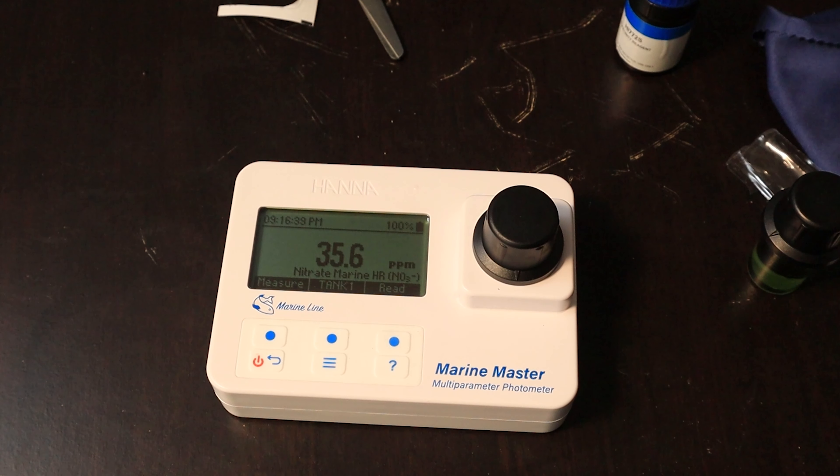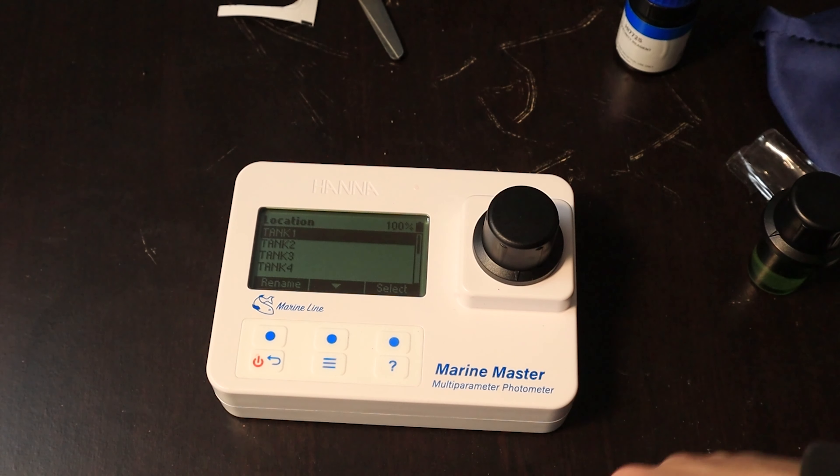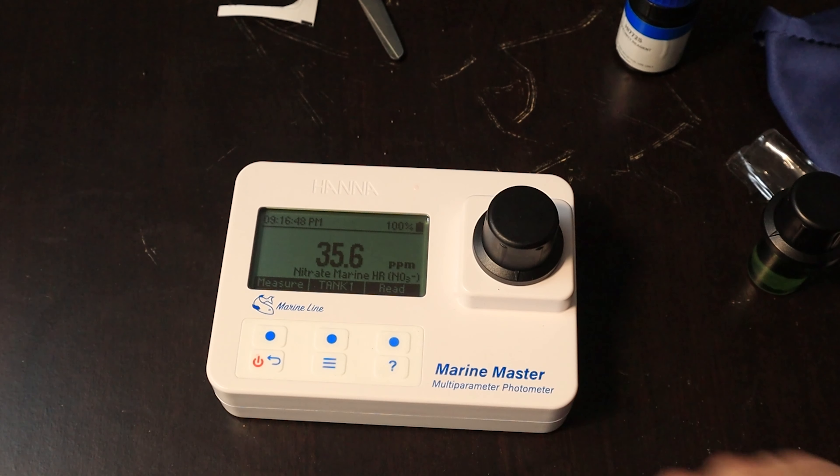A little high — not what I wanted it to be. 35.6. Let's do some more tests.